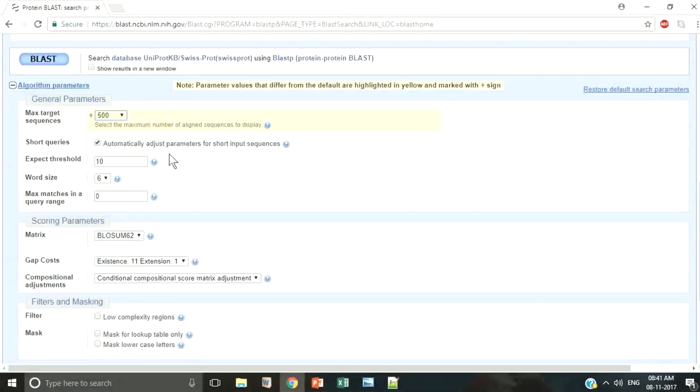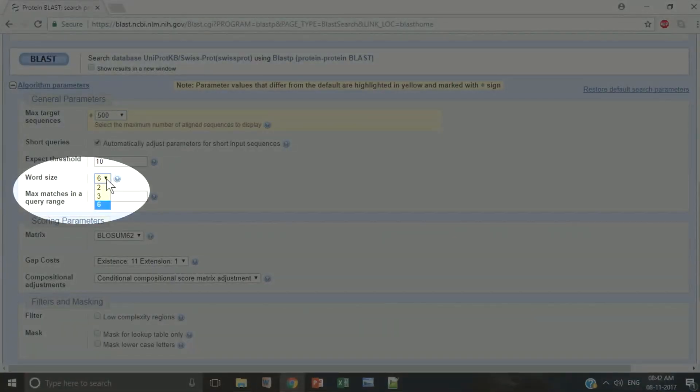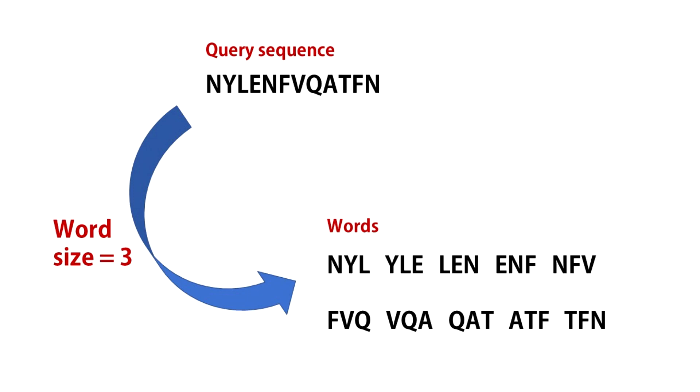See this option word size. This is crucial to the first step of running BLAST. A word is a series of characters from the query sequence. The default length of BLAST peak search is six characters. A sliding window is used to break the sequences into segments of six residues each. These segments are called words.